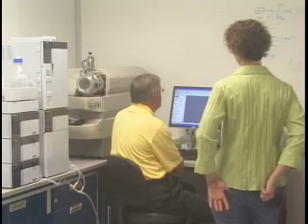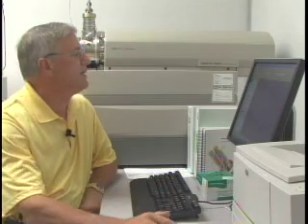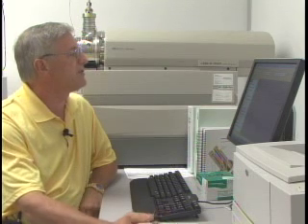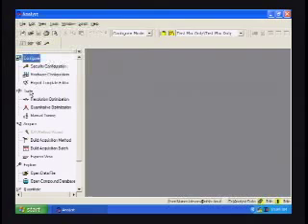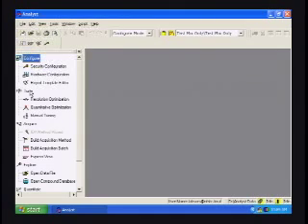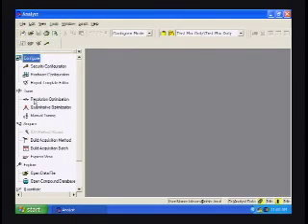Obviously, before any experiments can be performed, the system must first be checked to see if it's in proper tune. Under the tune icon here, there is resolution optimization, quantitation optimization, and manual tuning. The manual tuning is simply a check of the mass spectrometer to be sure that the mass assignment, the peak resolution, etc., all falls within the necessary criteria. If it doesn't, then you go to resolution optimization, which is an automated method for bringing the system into a proper tune.